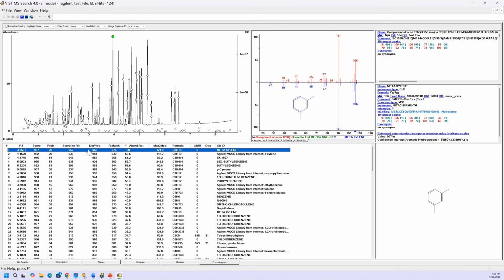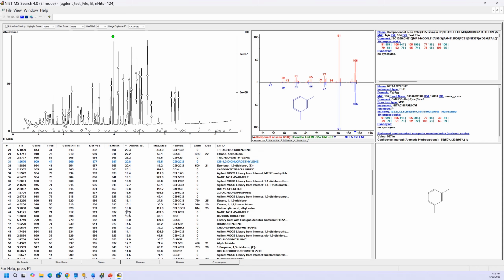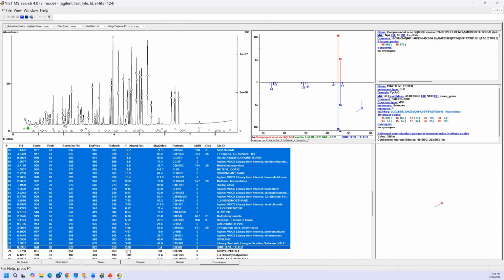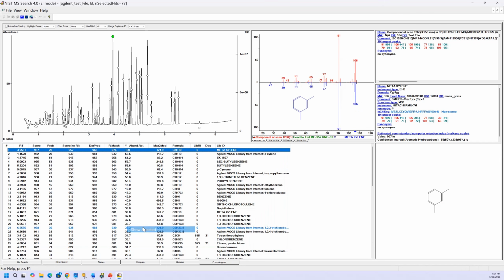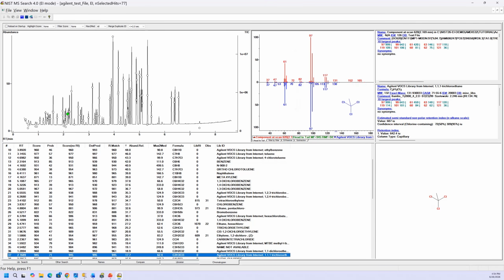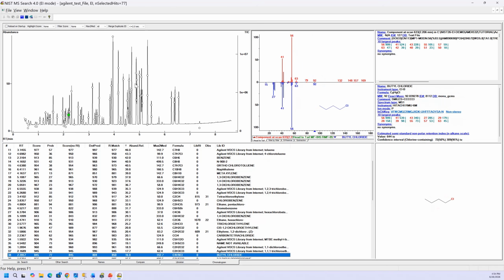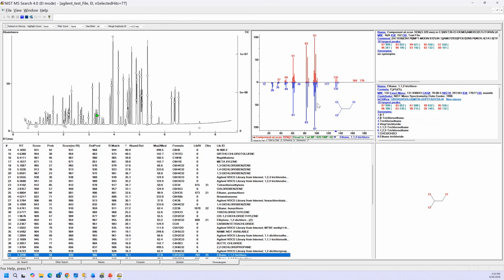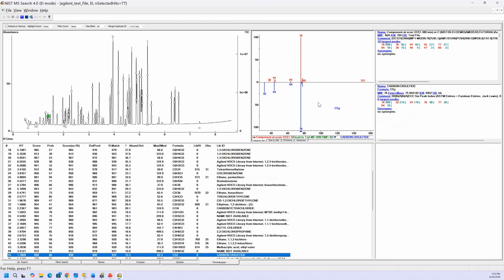And you could just look again by left clicking, go to the shift key, and let's look at everything above maybe, oh gosh, let's say 2% here and say show selected. See, that got rid of a lot of the small components. And then you could just click on where you wanted to start, use the keyboard again, up and down arrows, and step through and compare as you look at them to see if the identifications, the unknown versus the library, look reasonable. So very easy to do.